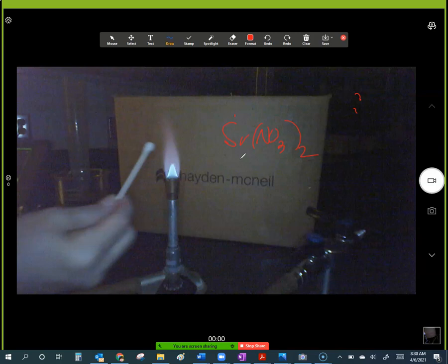So let's see if you guys, from the camera, the sodium's on the left, the strontium's on the right. Do you see a difference between the two? There's the sodium. You get a little more red with that one, maybe. Not really looking at the camera.